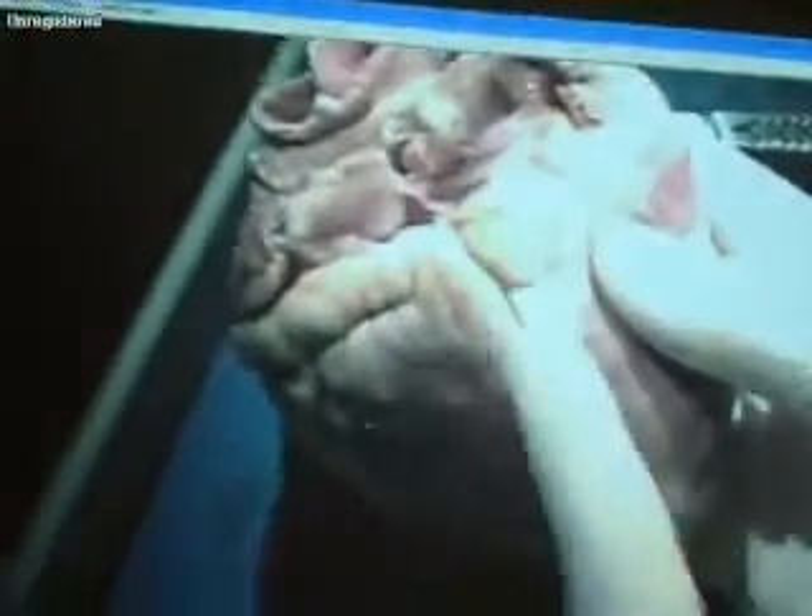Turning it over to the back of the heart — if you look at the very back of the heart you'll notice there's kind of a T-shape. That's where the coronary sinus is located. In the back, you also have an interventricular sulcus. This is a posterior interventricular sulcus in the back.